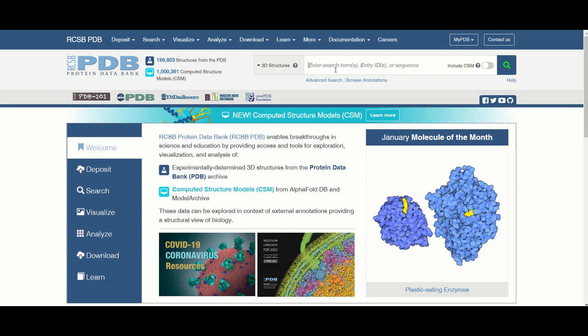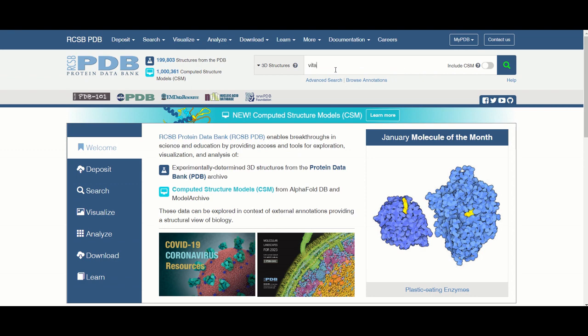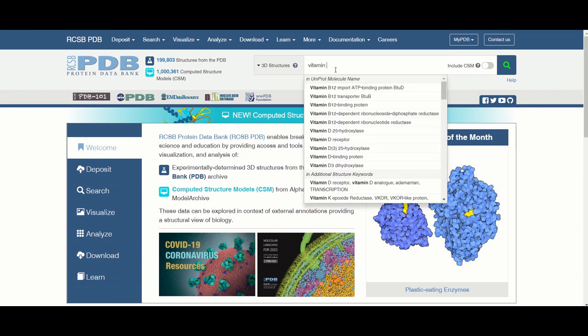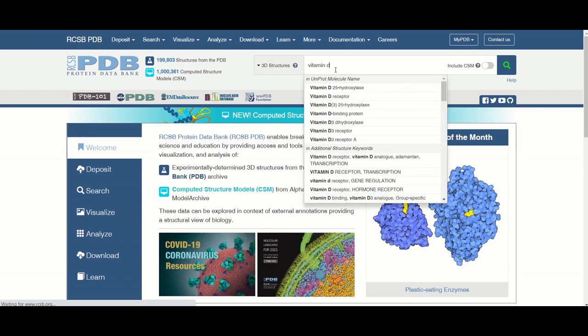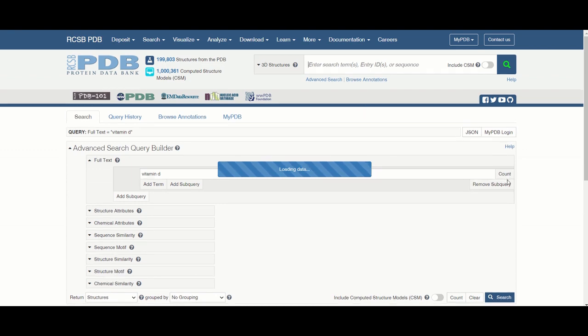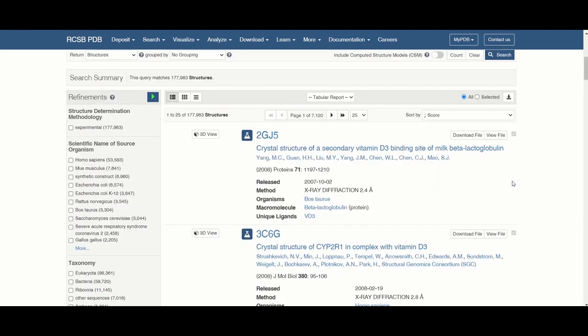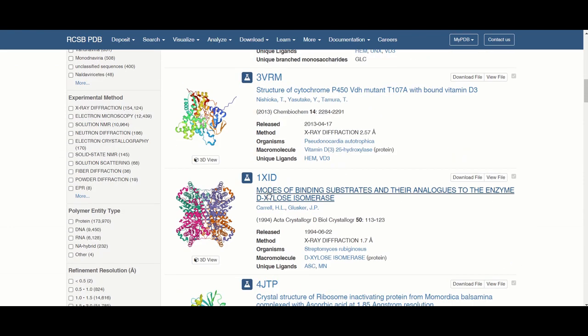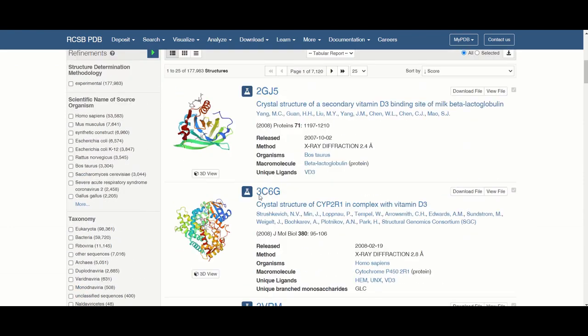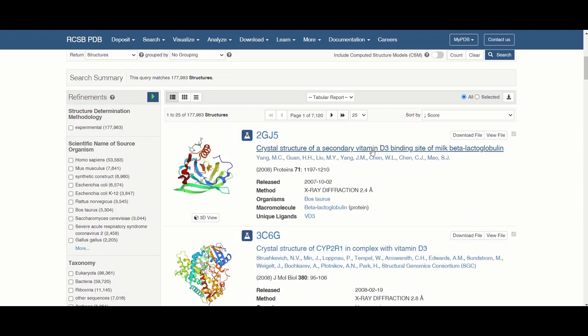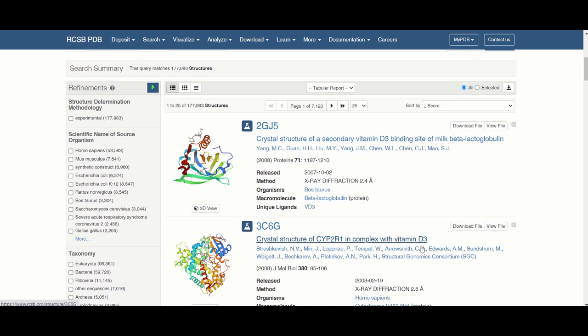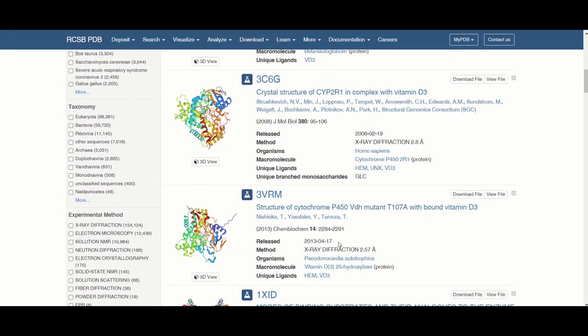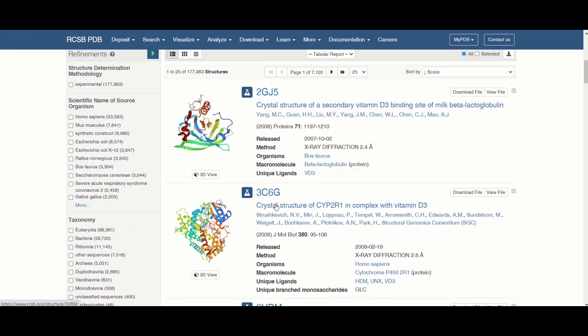For instance, if we go here and look up the vitamin D receptor, you can see that it will then load in this crystal structure of a bunch of different vitamin D receptors. A bunch of these are in complex with vitamin D3 like you can see here.